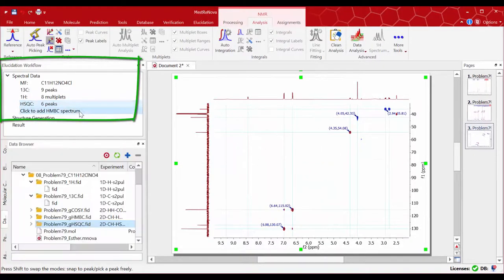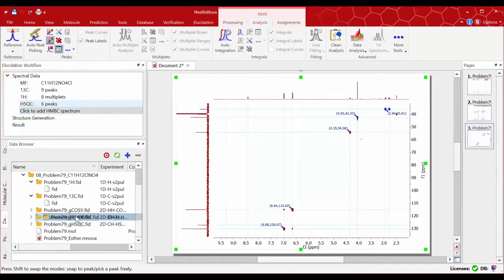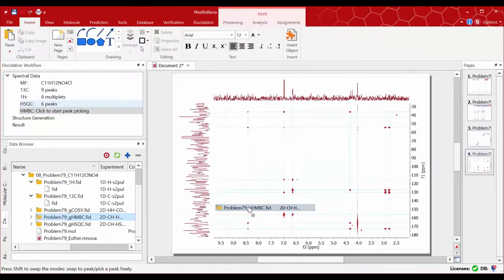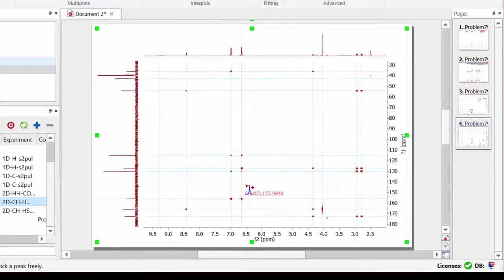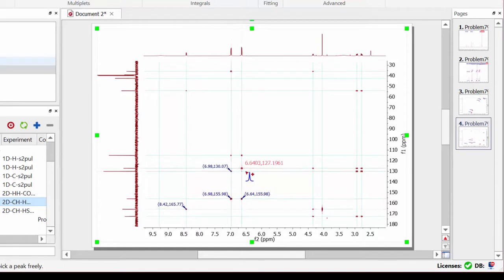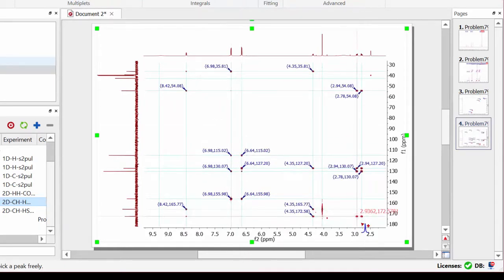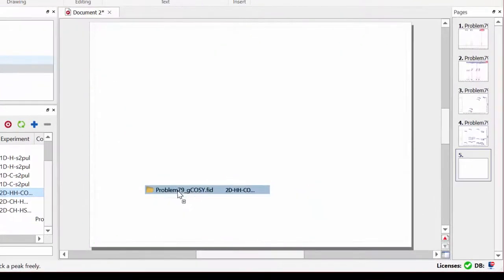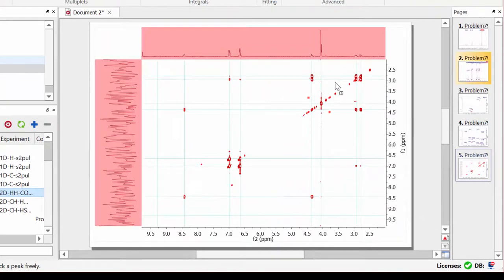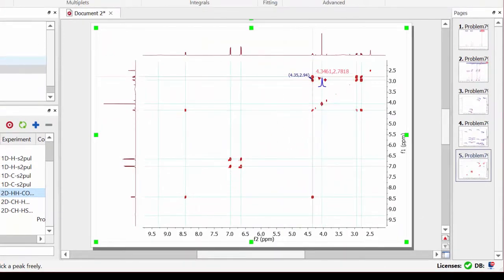Add your HMBC experiment and repeat the same steps as before. You can do the same for your COSY experiment.